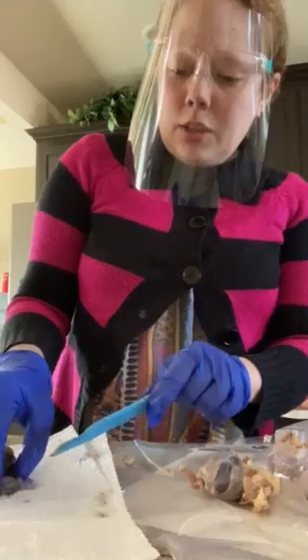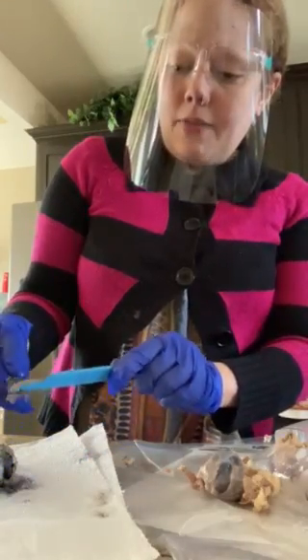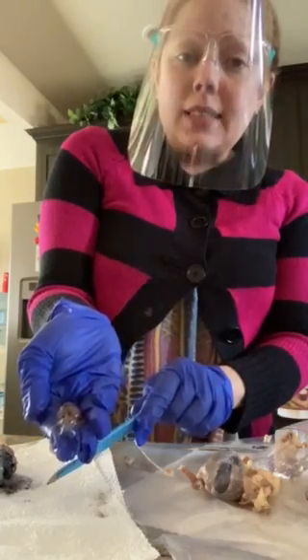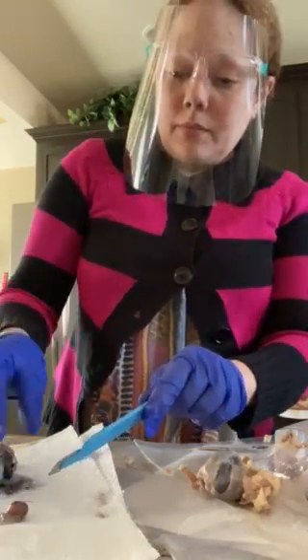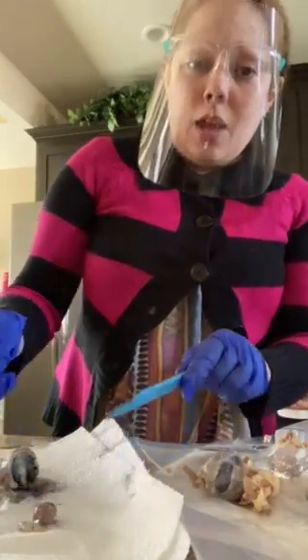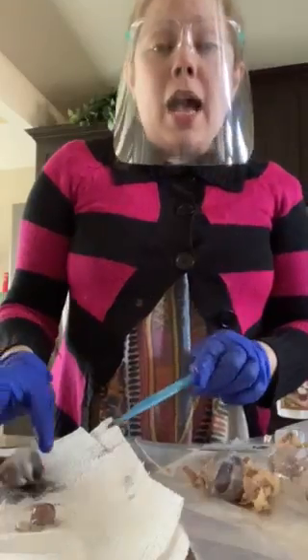and this hard part that I have on my hand is the lens. Is the lens of the cow. I don't know if you can see it there. So that's my cow eye dissection.